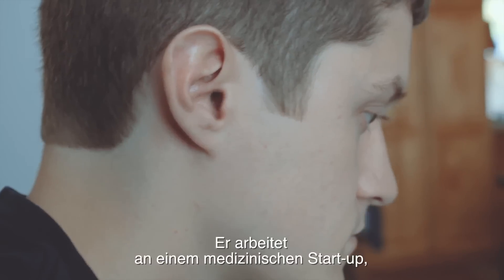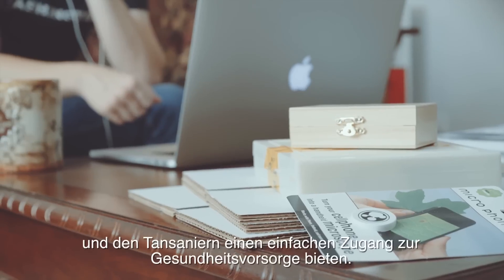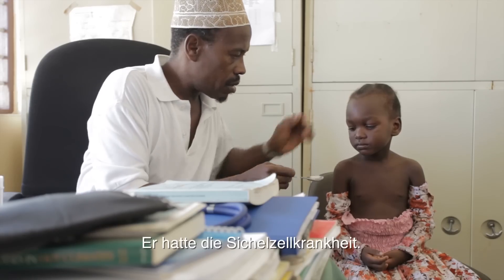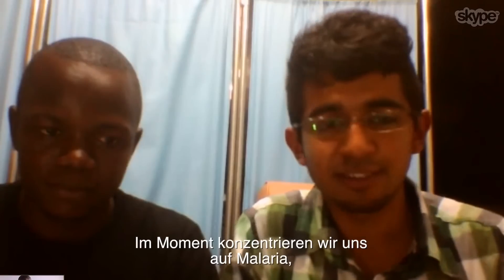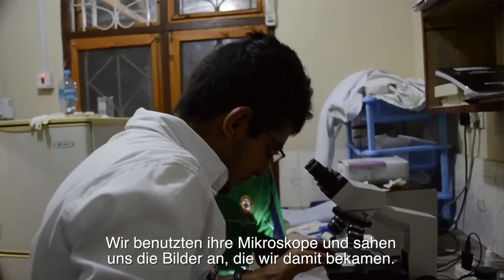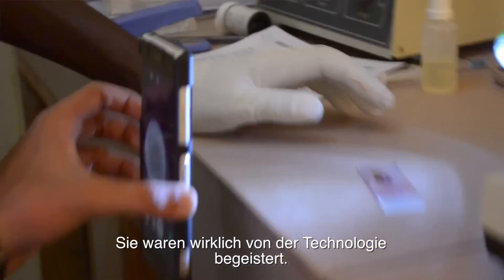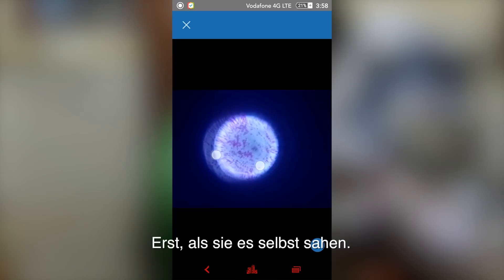Recently I got an email from Basil Malakai. He's working on a medical startup and wants to use the microscope to screen for common illnesses and bring health care to rural Tanzanians. He looked at it as a personal problem because he lost a brother in 2008 to sickle cell disease. The ratio of doctor to patient in Tanzania is 1 to 30,000 — that's devastating. So at this moment malaria is our focus, but we've also got sickle cell and leukemia. We went into the labs, had blood samples prepared, used their microscopes to see the images, then compared them to the ones from the lens. They were quite excited, but they didn't believe it works because it's so tiny compared to the microscopes in the laboratory — not until they see it working.